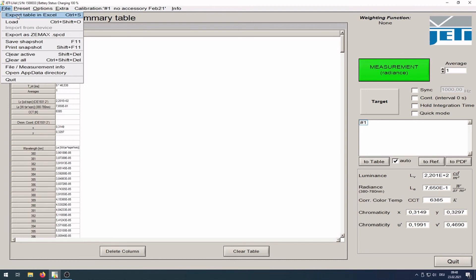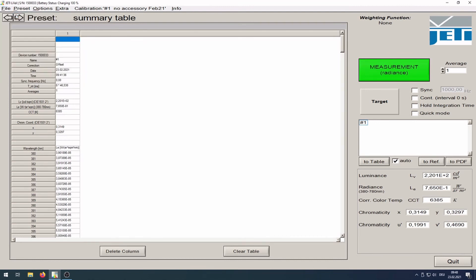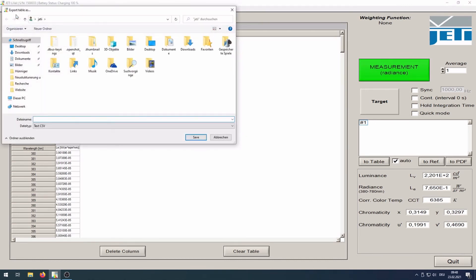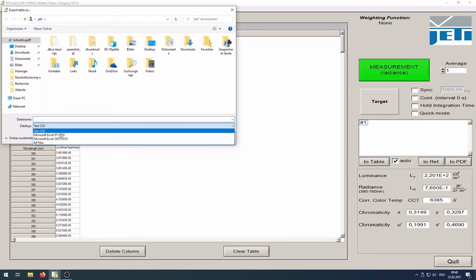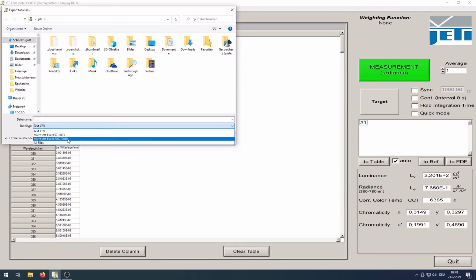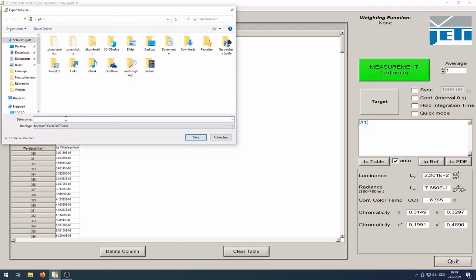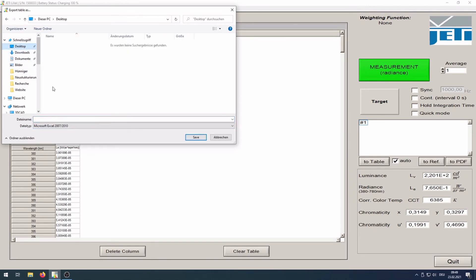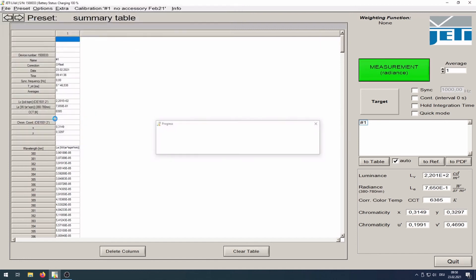Use File Export Table in Excel. In the next step, please select format CSV or XLS, storage location, and file name. Press OK.